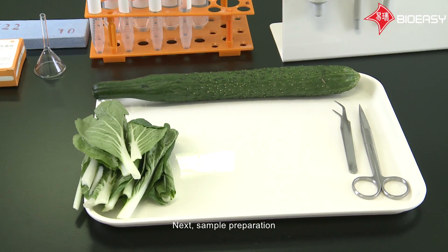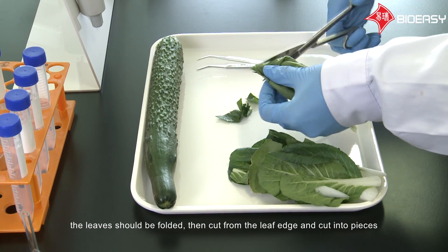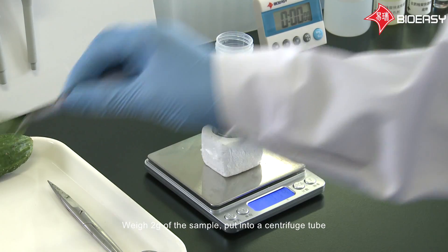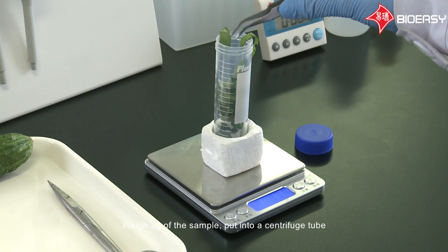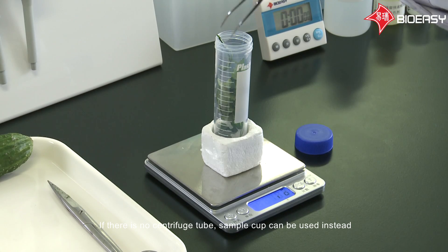Next, sample preparation. For leafy vegetables, when sampling, the leaves should be folded, then cut from the leaf edge and cut into pieces. Weigh two grams of the sample and put into a centrifuge tube. If there is no centrifuge tube, a sample cup can be used instead.